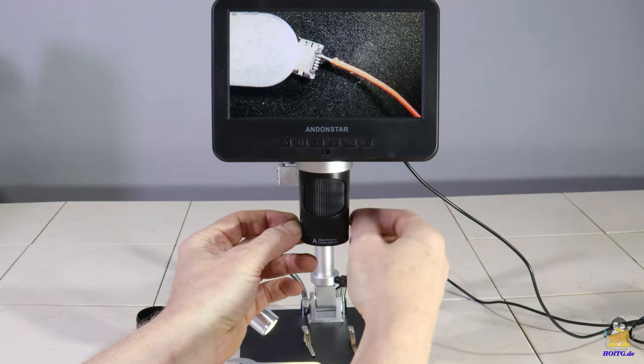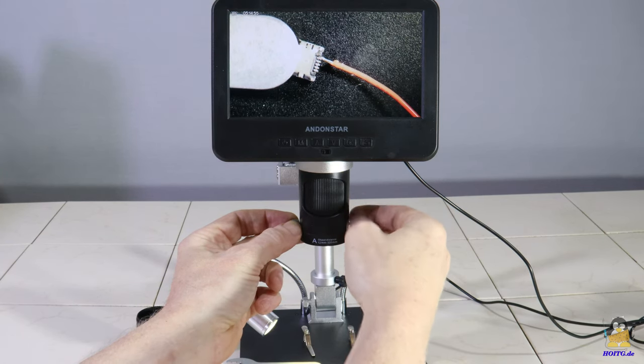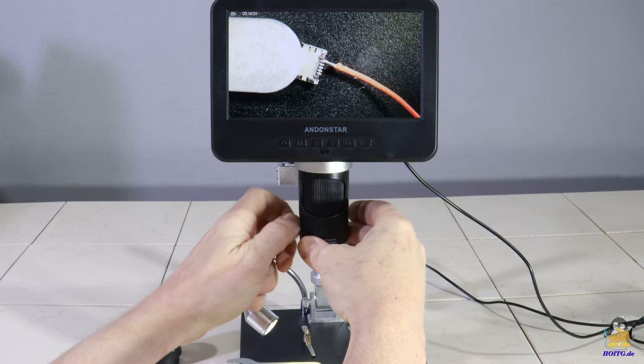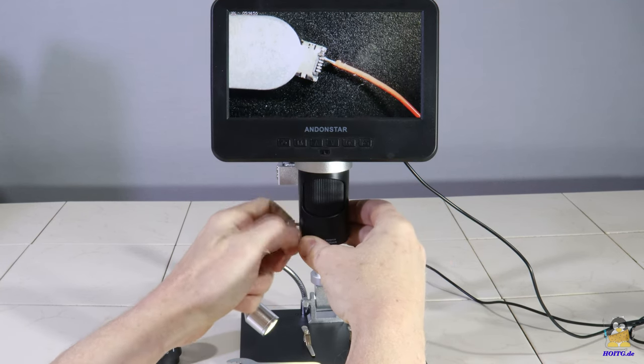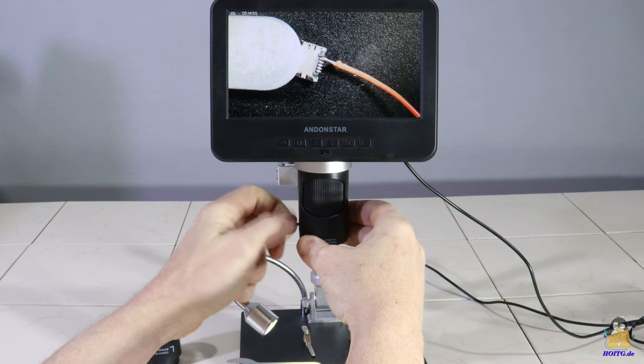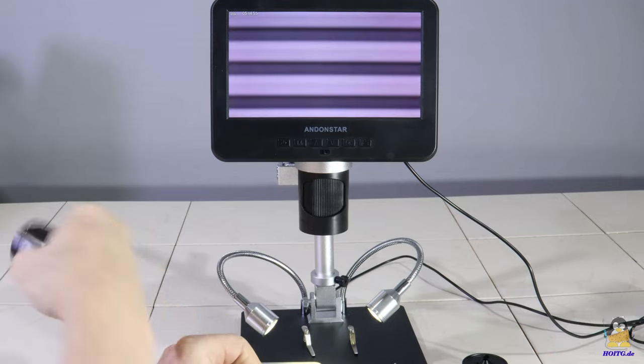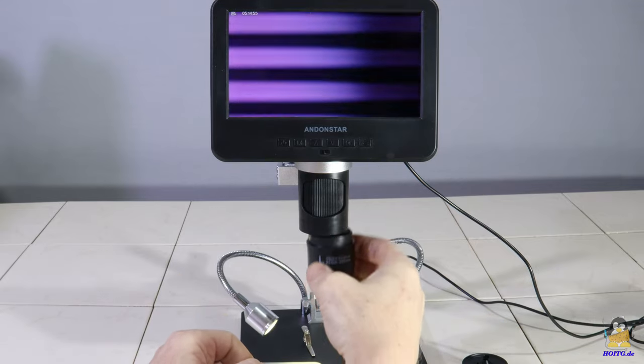Swapping lenses is done by loosening two screws, taking out the first lens without dropping it, and finally screw on lens number 2.